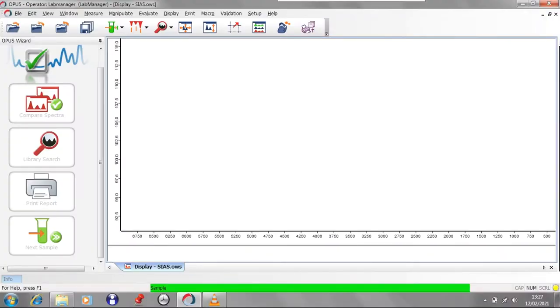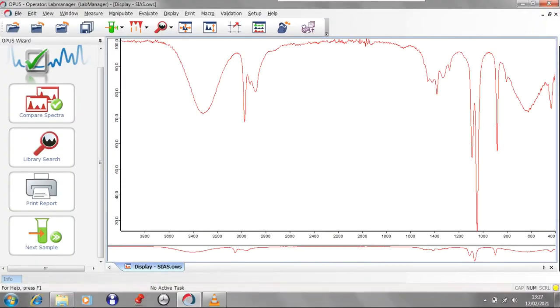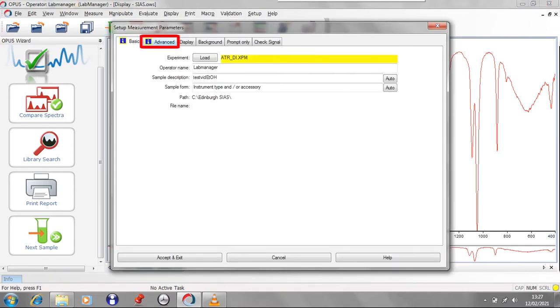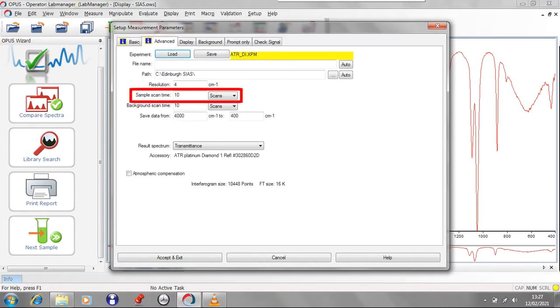Once the sample measurements are completed, your spectrum is displayed. You can increase the number of scans taken during sample measurement and set up measurement advanced settings as shown for increased sensitivity. Be aware, however, that this will mean sample measurements will take longer to run. Ten scans will give high enough quality data in most cases.